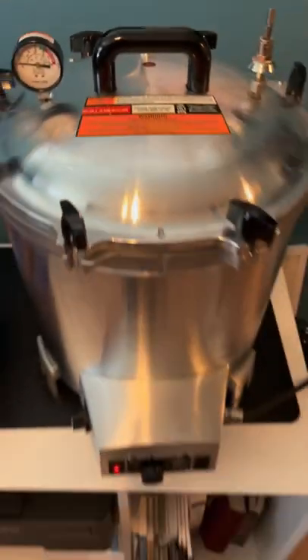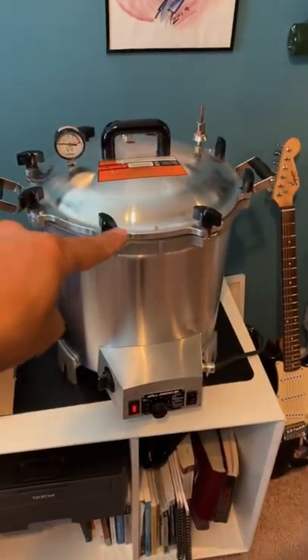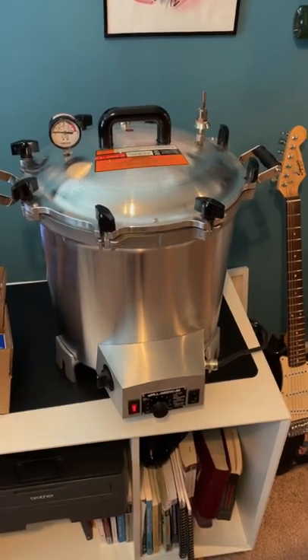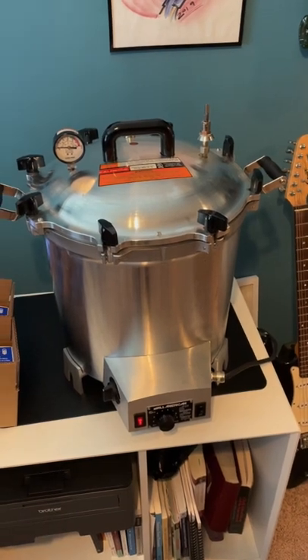They're just warming up, but we'll cook your grains in this All-American autoclave. That way your grains are free from contaminants, and your spores have a fighting chance to grow some mycelium.